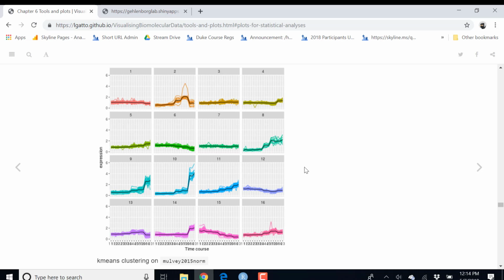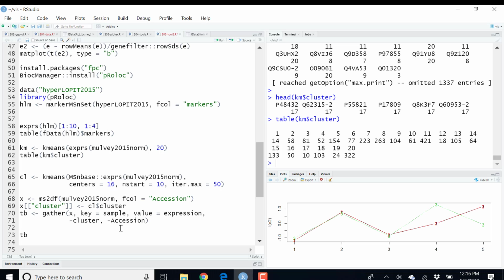Very often when these methods identify the number of clusters automatically, they become rather advanced. There is specific modeling that happens behind the scenes with Bayesian statistics that are implemented for that very specific problem, and then they might estimate these values automatically. But that's very often an actual tool that has lots of underlying methods under the hood, more difficult to tackle. And so the first thing to do is to use plain k-means, get a rough estimation of the number of clusters, and see how k-means performs before moving on to something more difficult.